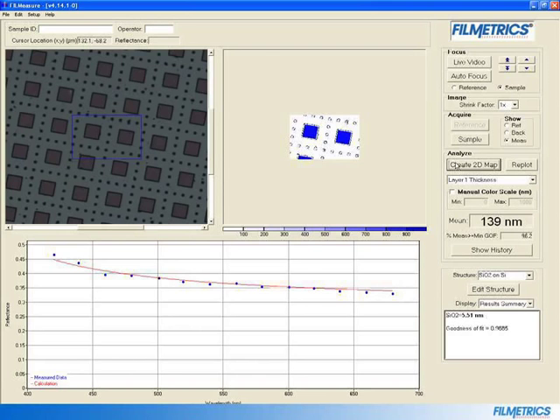You've now completed your first measurement using the Filmetrics system. If you have any questions, please contact Filmetrics for an online support session.